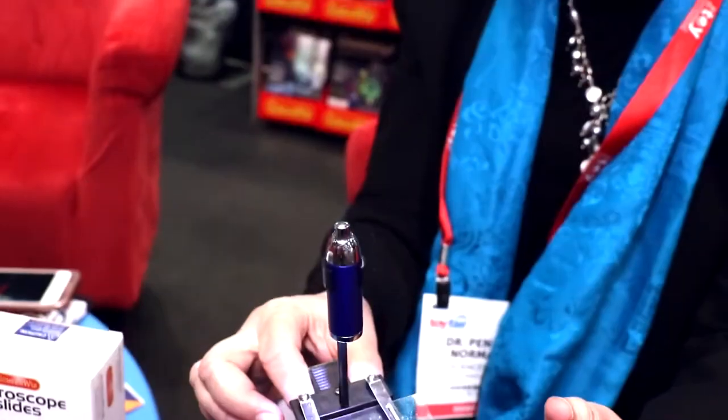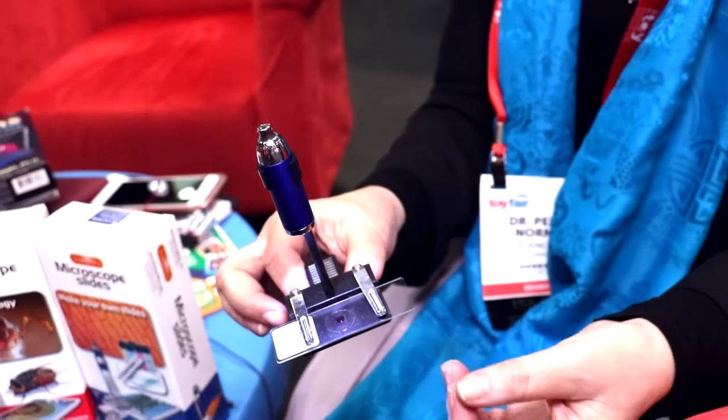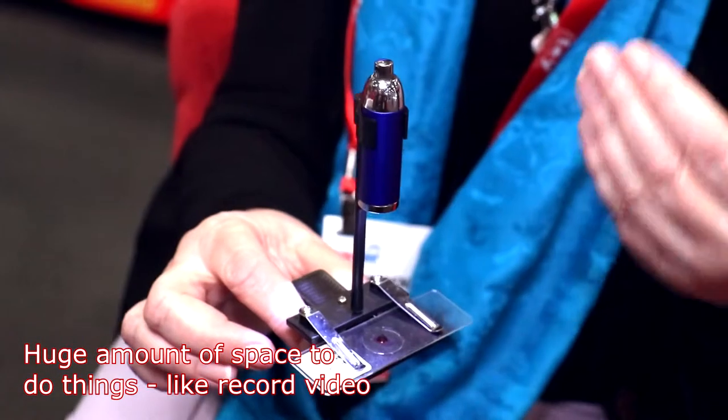It makes all of this very accessible to a child. One of the things that surprised me is how globally children can function with the camera, even starting at 4 or 5. One interesting thing about this microscope is there's a huge working distance above the lens, so you can actually build a slide in place and record what you're doing in slow motion. You can video record as you build a slide — harvest your own cheek cells, place them on the slide, watch as they drop, add the stain, add the cover slip, and then record in slow motion as your nuclei turn blue.